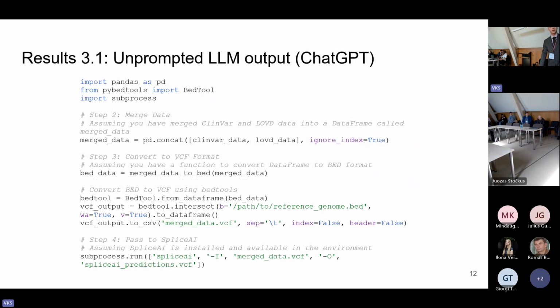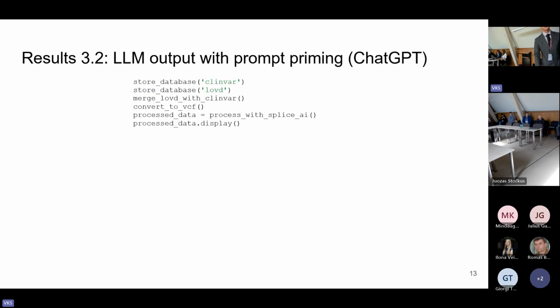It will run successfully, but the rest of the code is not good. But we can notice that after prompting, it outputted very clean and nice code. This code is absolutely correct. If I run this, it will give the requested output.